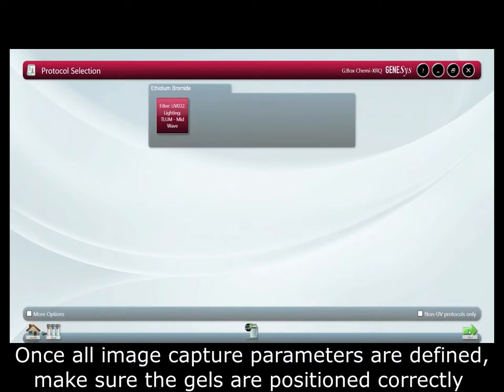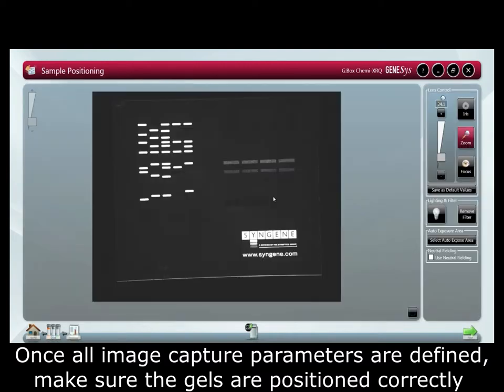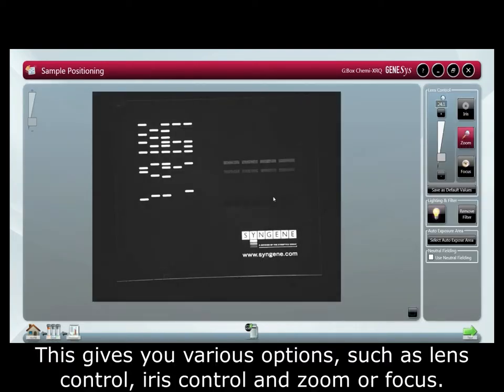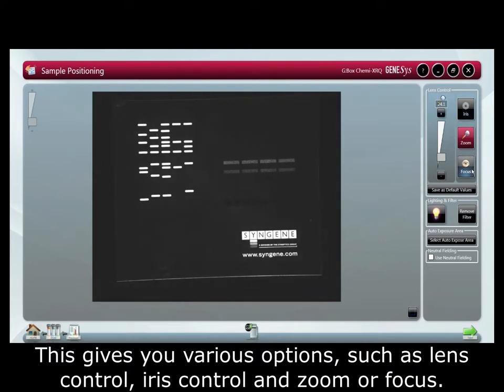Once all image capture parameters are defined we can make sure the gel is positioned correctly with the image preview. This gives you various options such as lens control, iris control and zoom or focus.